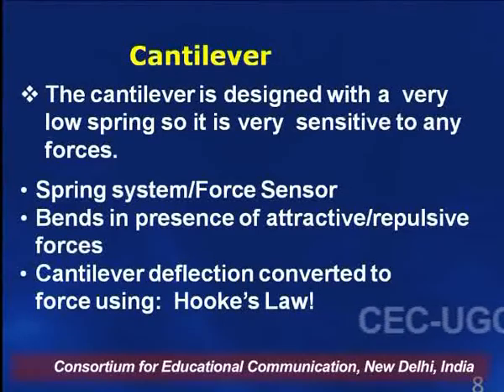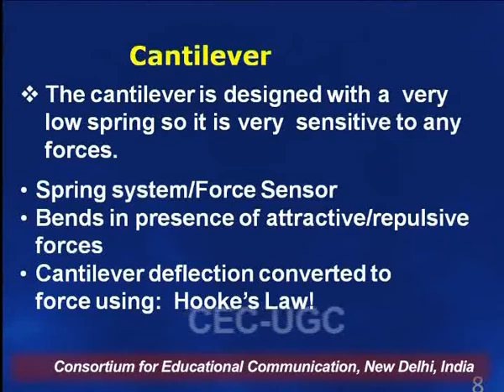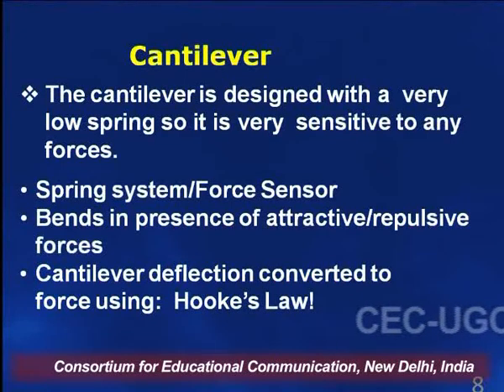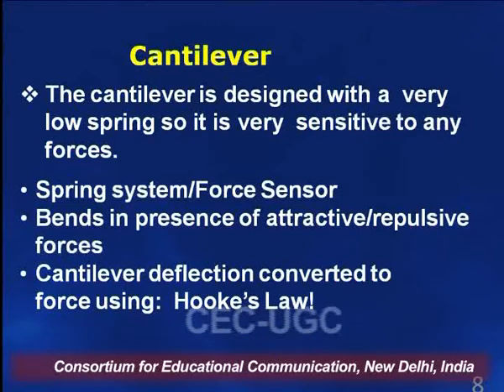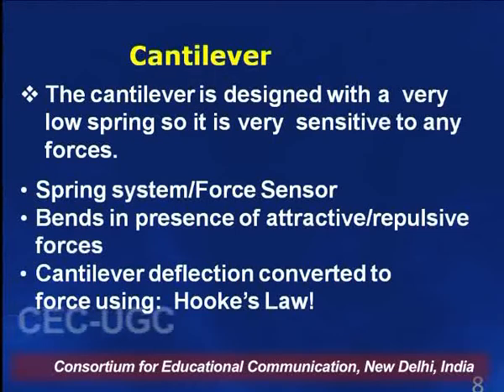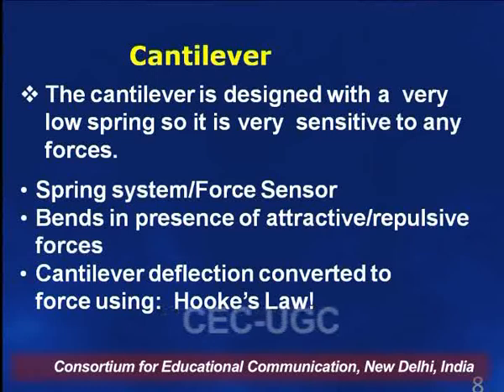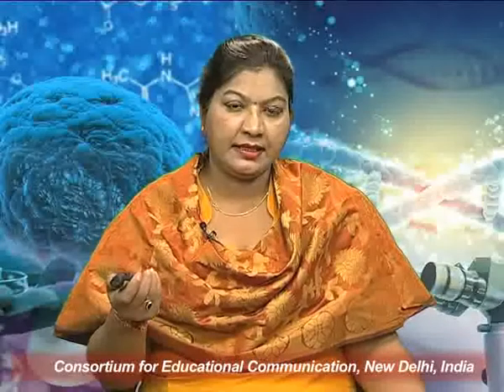Second is the cantilever. The cantilever is designed with a very low spring constant so that it is very sensitive to any force, because we are giving a very minimal force to the cantilever, so it should be so sensitive that it can move or vibrate using this force. It is a spring system and a force sensor. It bends in the presence of attractive and repulsive forces as the laser beam falls upon it.